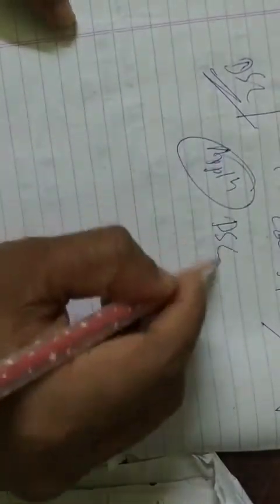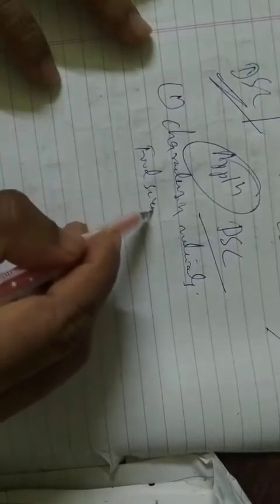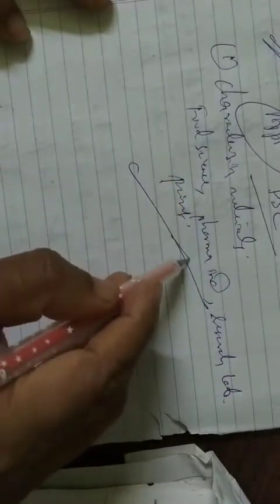Now if you see the applications of DSC, it is used in characterizing materials, like in food science, pharmaceutical industries, research labs, the paint industry, and like this. In most of these, DSC is used to see the phase transition of substances.